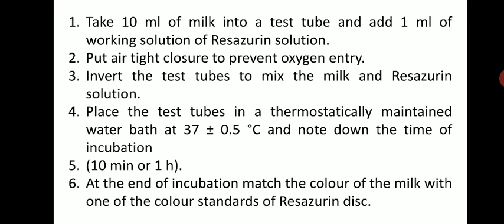So you mix this dye with milk and place the test tube in a thermostatically maintained water bath at 37 degrees Celsius, and note down the time of incubation.